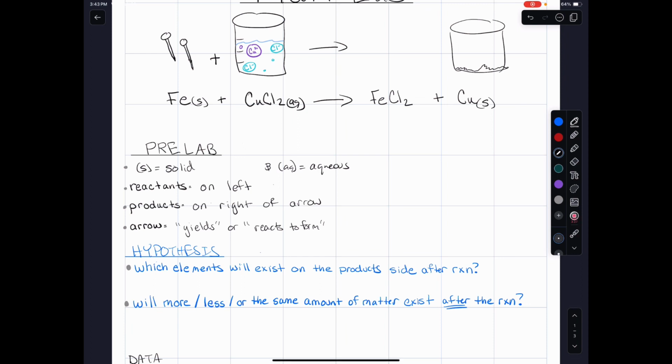The iron chloride is a salt, metal, nonmetal, an ionic compound. So in water, it was the part of the liquid that was in the beaker, the green, murky liquid that we poured out as waste liquid, because we're not measuring that. So this does look like a reasonable chemical reaction.